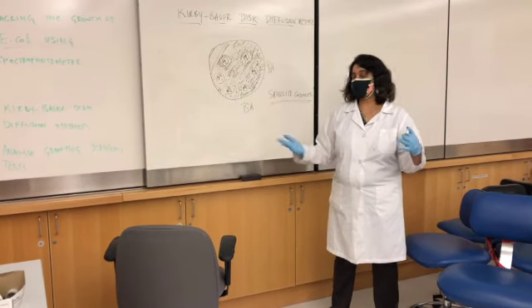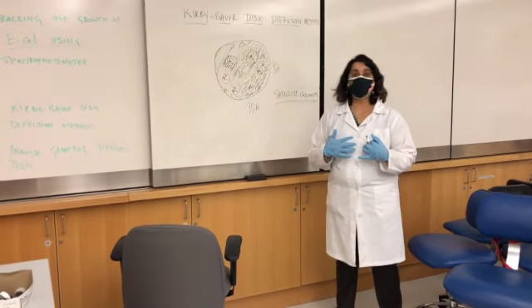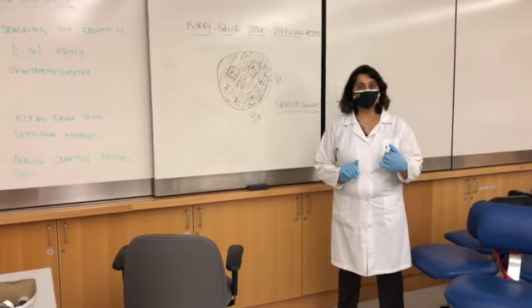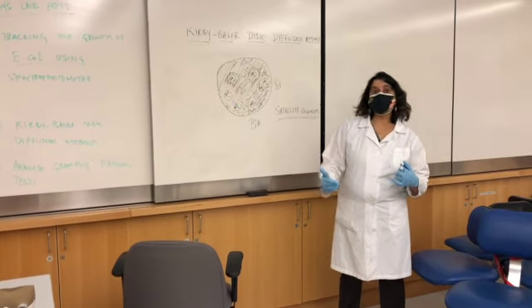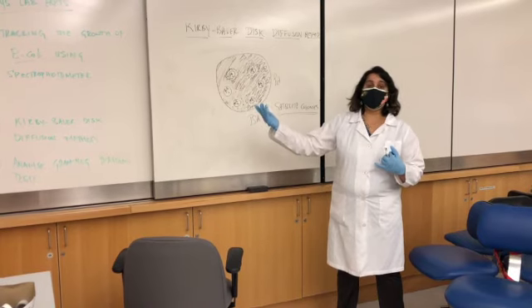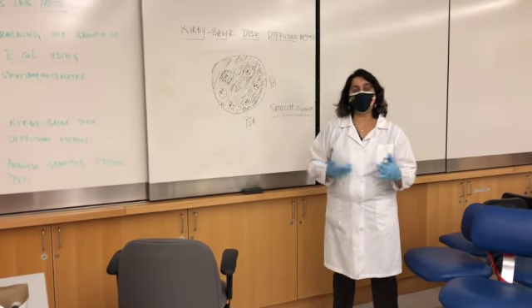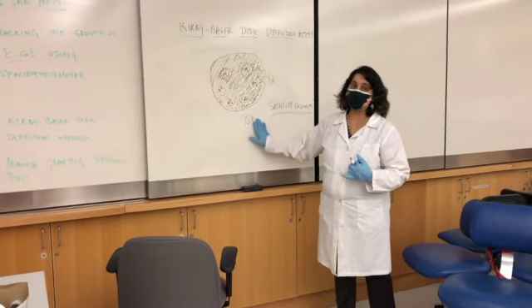They can be because of some mutations, random mutations can happen, and sometimes bacteria, when it undergoes a lot of stress, all of a sudden, it becomes resistant to the antibiotic. Okay? When you see there are satellite colonies, you would want to avoid that antibiotic. But if you don't have any choice, if the patient is allergic to all other antibiotics and this is the only choice, then you can go with that antibiotic. Okay? So those are satellite colonies, and this is the Kirby-Bauer disc diffusion method.